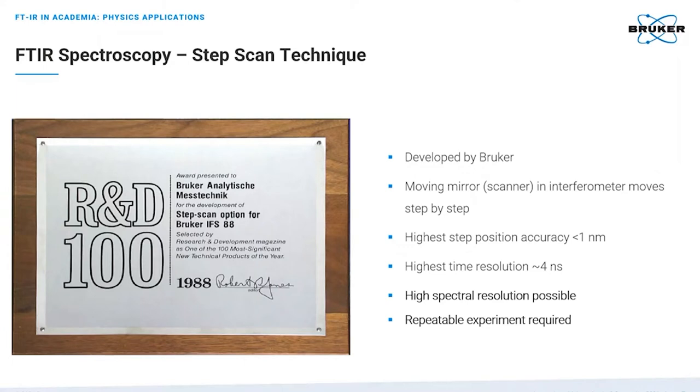Now, coming to the TRS method. One challenging scenario in physics is to follow very fast processes. For example, to follow optical profiles with fast changes and fluctuations along time axis. A normal IR transmission or ATR measurement using a modern spectrometer lasts maybe a few minutes. A fast chemical reaction can be monitored with FTIR by applying 100 spectra per second.